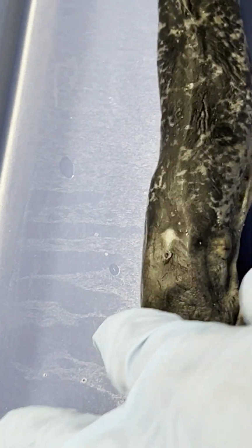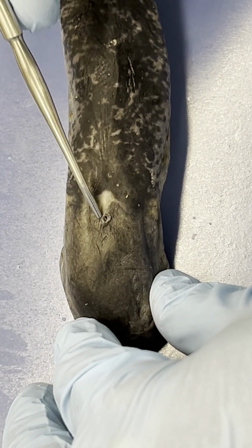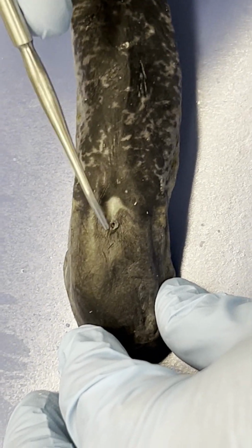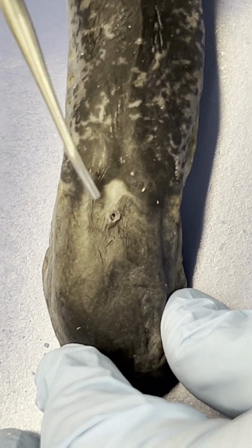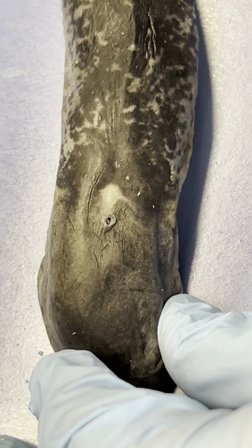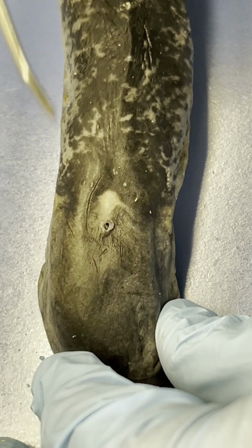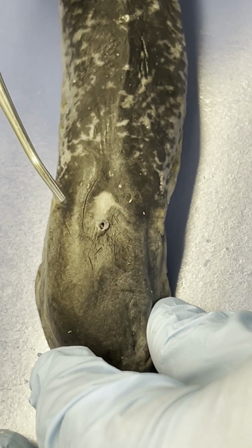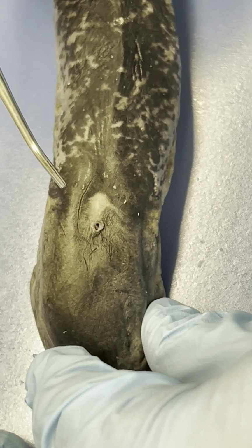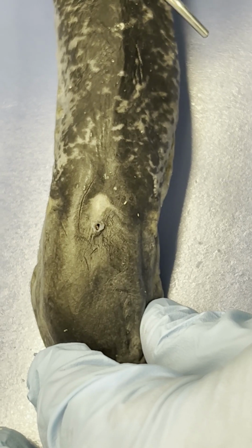What else do we have? If we look at dorsal of the head of the animal, we see this little opening right here. This is the animal's, the lamprey's nostril. Well, it is a nostril, but the specific term that you guys need to know is it's a long one, nasohypophyseal opening. Nasohypophyseal opening. Say it out loud right now to yourself. Nasohypophyseal opening. But again, it's basically its nostril.